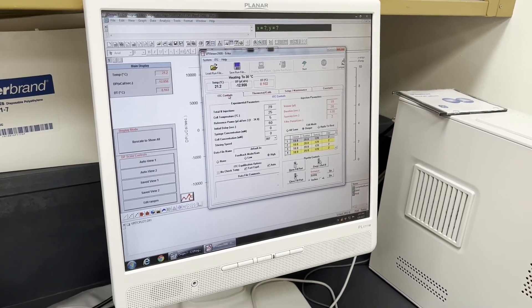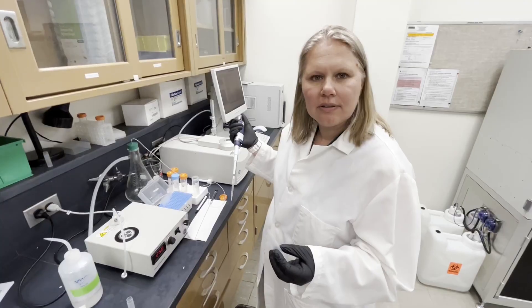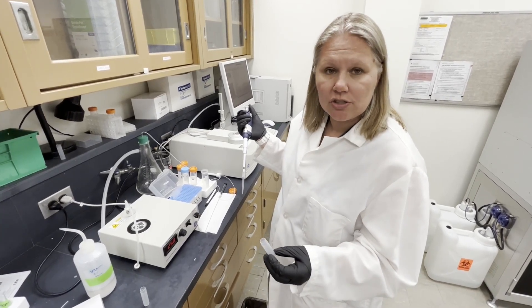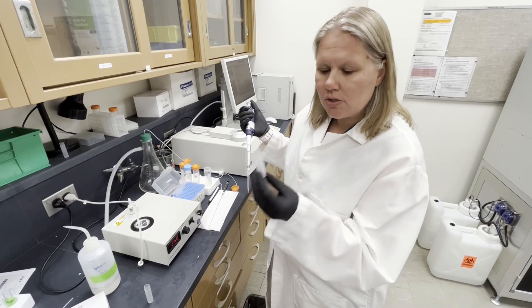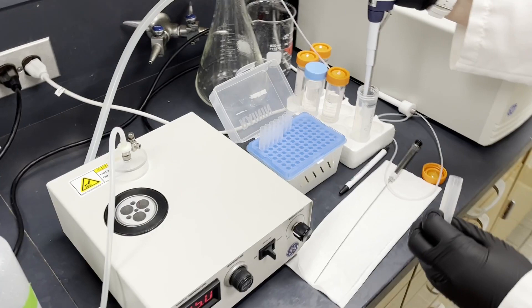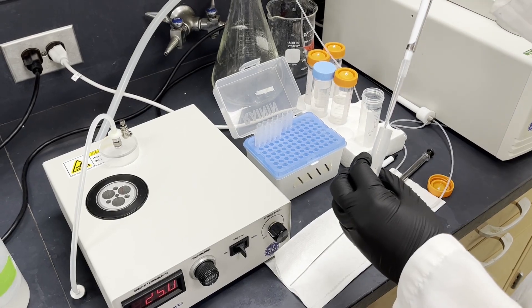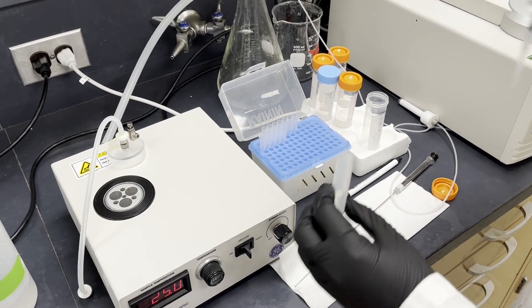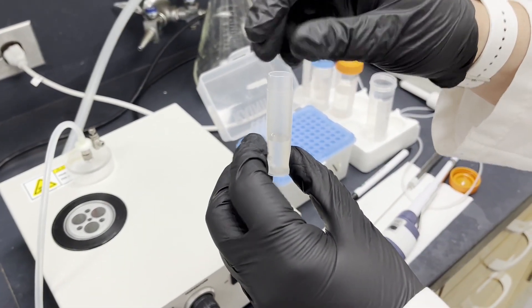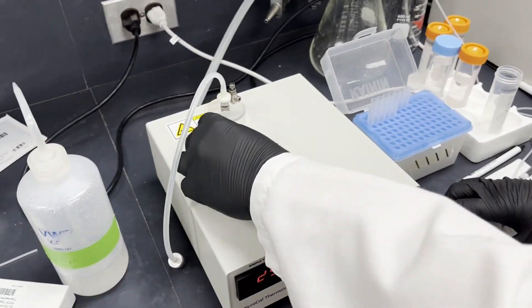Now we are going to prepare our samples. Again this is just water. For both your sample going into the cell and into the injection syringe, you're going to want to degas them. We use these sample tubes that fit in the degasser. Again I'm just using water as an example and two milliliters is the perfect amount. So what you want to do is take these tiny stir bars that's already been pre-rinsed with water and put it in here.